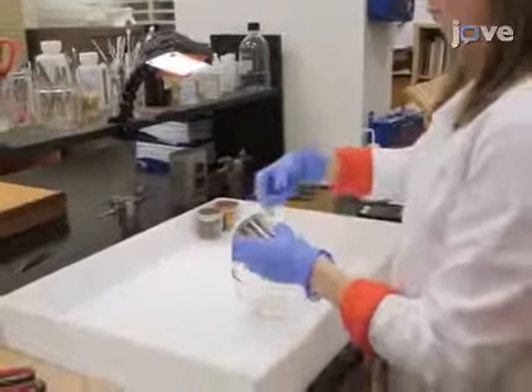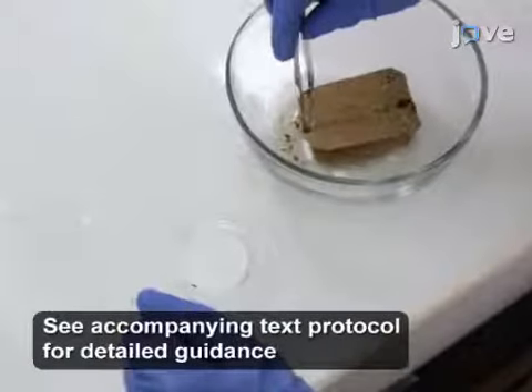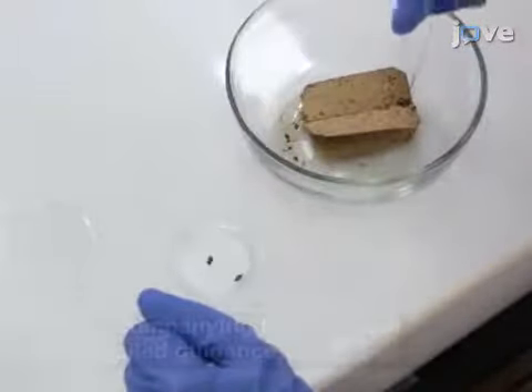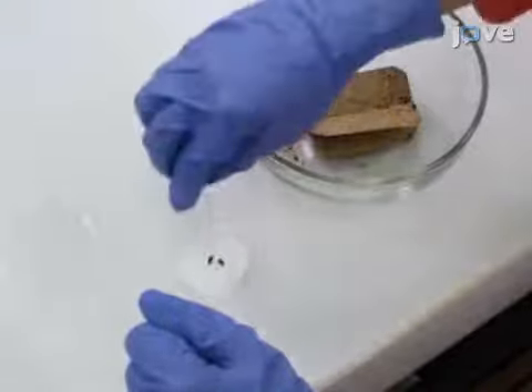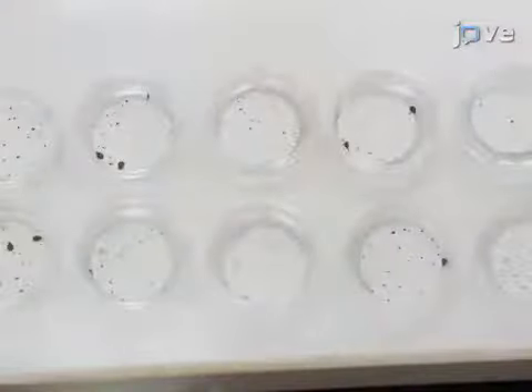To begin the experiment, pull 5 to 10 mated, well-fed adult female bedbugs from a colony and place the females into a petri dish with filter paper. Prepare 10 replicates to ensure there will be enough eggs for the insecticide assay.